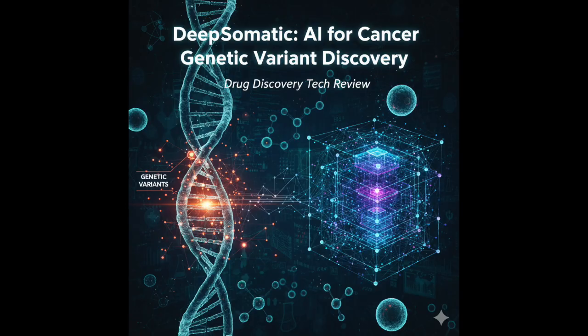The fact that DeepSomatic CNN, trained on the high-quality, multi-platform Castle data, could slash indel errors by 95%. It shows that the image-based approach is capturing the complex visual patterns around indels, the alignment signals, the read support, the quality scores, in a way that statistical models just fundamentally can't.